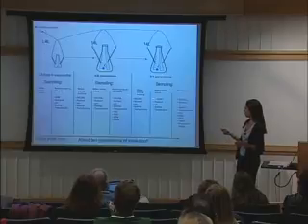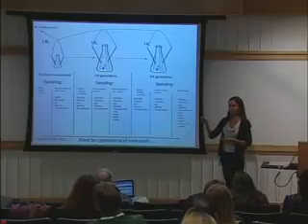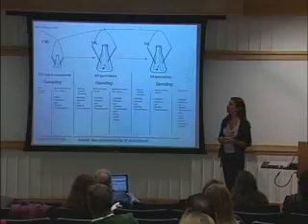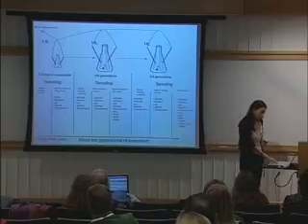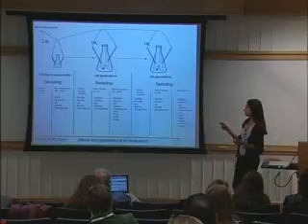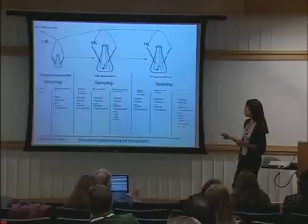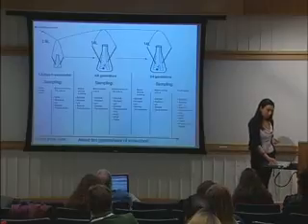and we take this kind of sampling, so we monitor what's going on, when we are pre-acclimating the cells, when the cells are undergoing acclimation during the experiment, and then we can go back and see if something went wrong during the experiment. And then, of course, at the end, because in this case we need a lot of cell biomass, we need to harvest for iTRAQ for proteomic analysis at the end of the experiment. We can only harvest once, but at least we know that the cells have been pre-acclimated for quite a while.